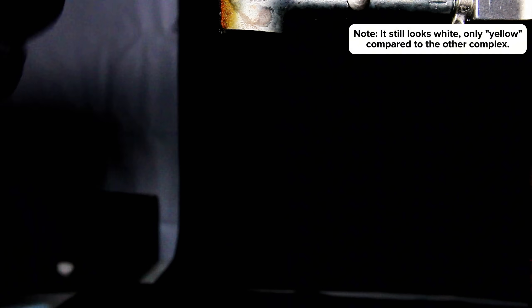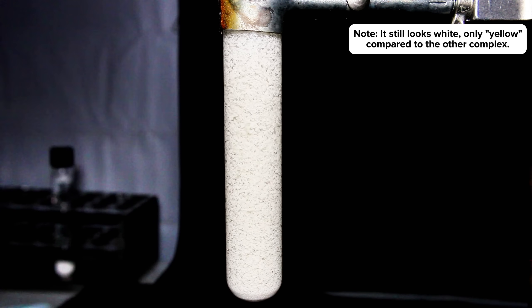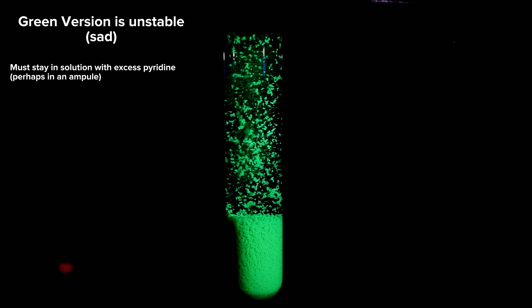When exposed to the same UV light as before, the complex made this way is a distinct and beautiful cyan green. The color difference here is particularly obvious when placed right next to the yellow fluorescent version. As for why I made so little of the green version, the main reason is that it's highly unstable and unfortunately not something I can really collect and store.